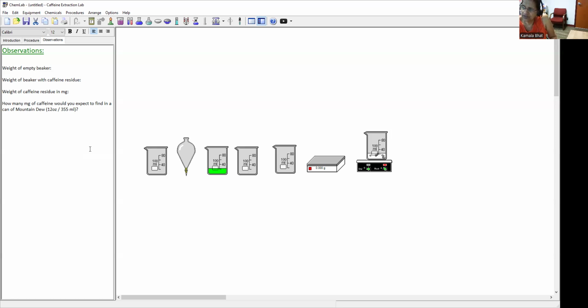After you do the discussion and conclusion, the discussion is, remember, always based on the result that you got, and also include what are the difficult points that you found when performing this experiment. Then you conclude your experiment by in one line stating how you separated out the mixture. What was the result of this separation? How many milligrams of caffeine you got? What was the amount of caffeine in the 12-ounce can? And what were the experiment difficulties?